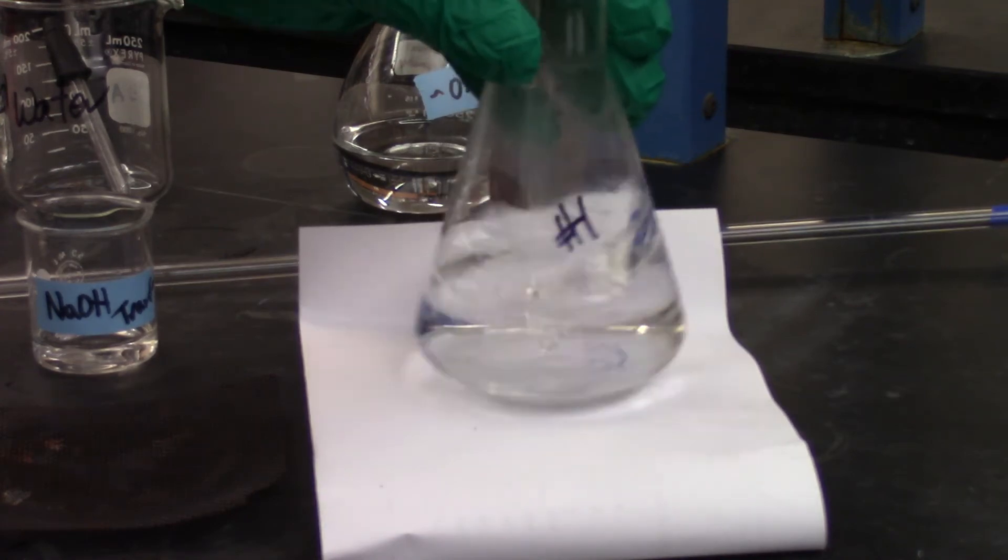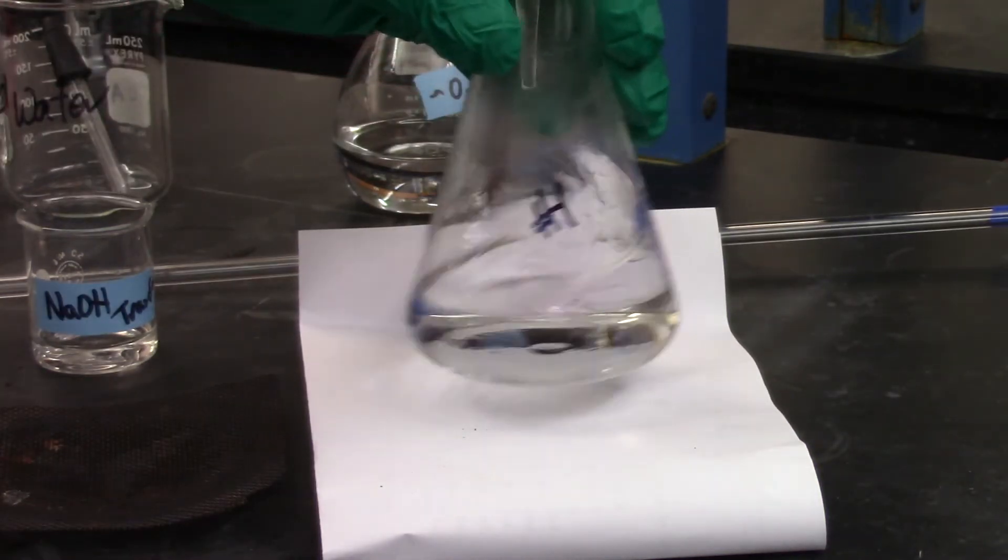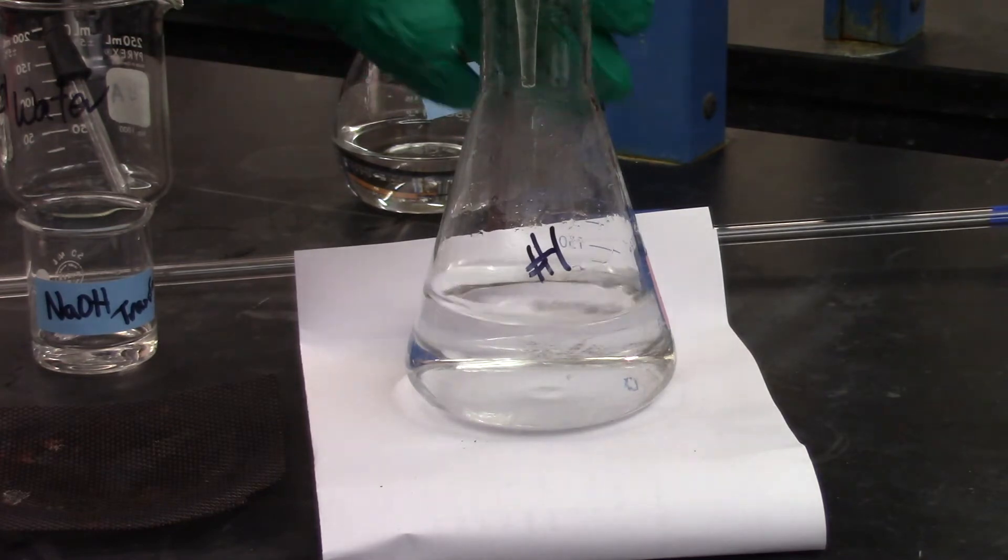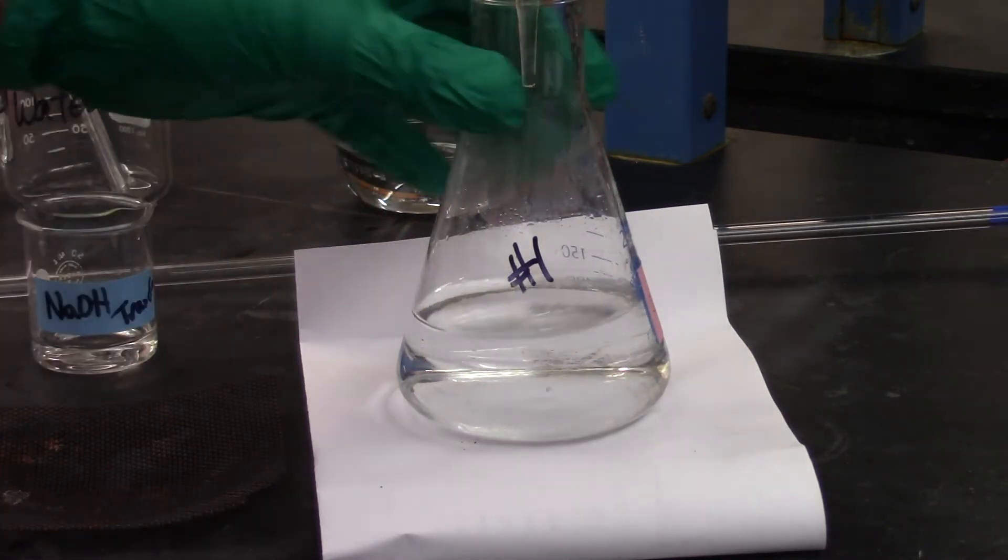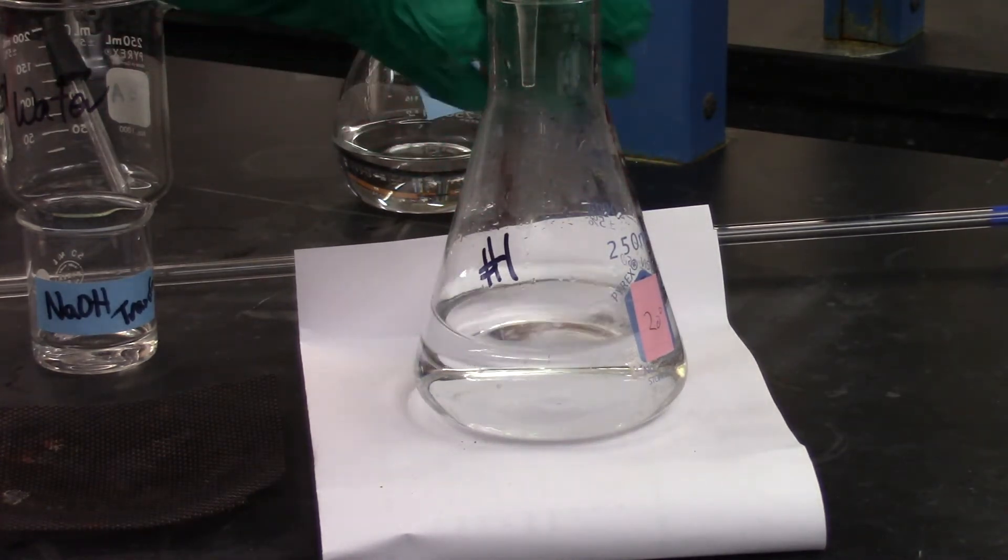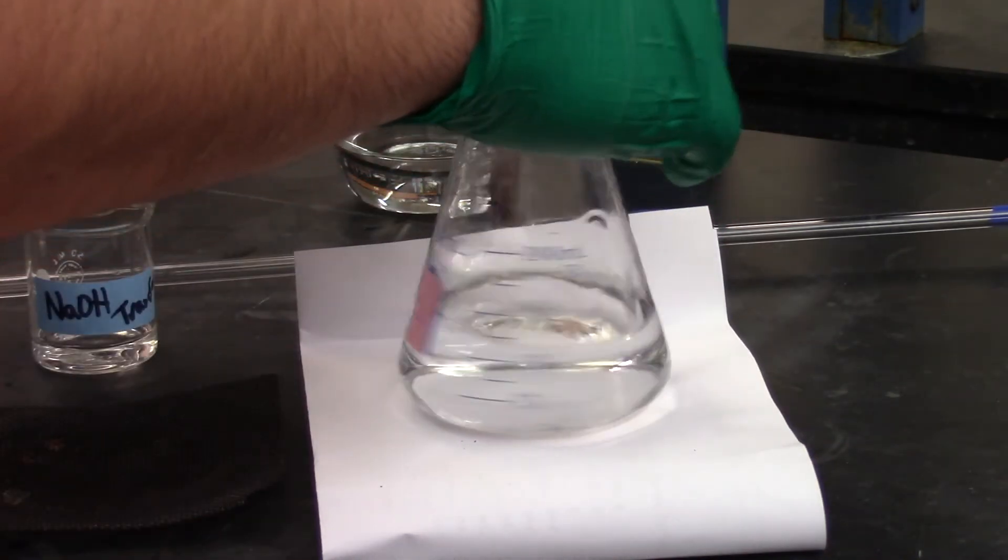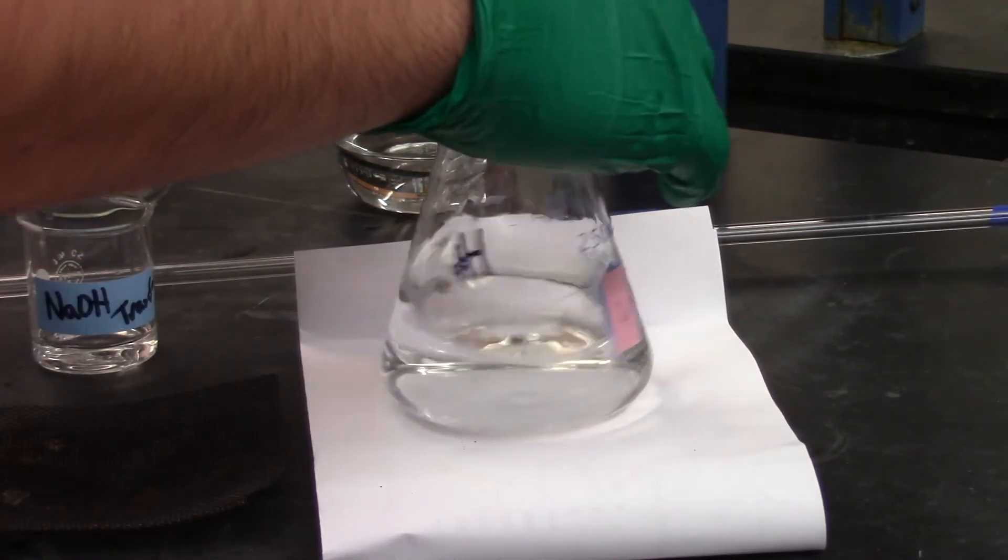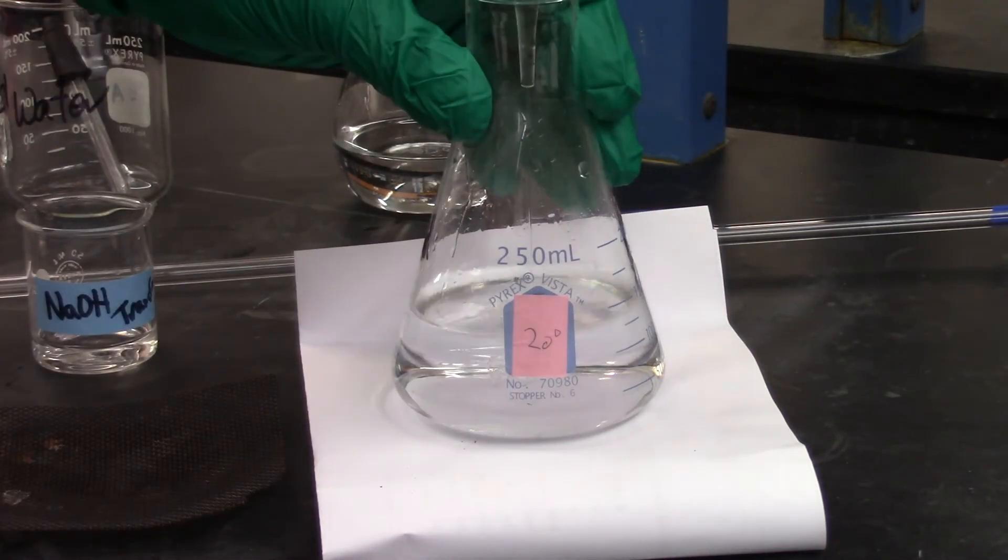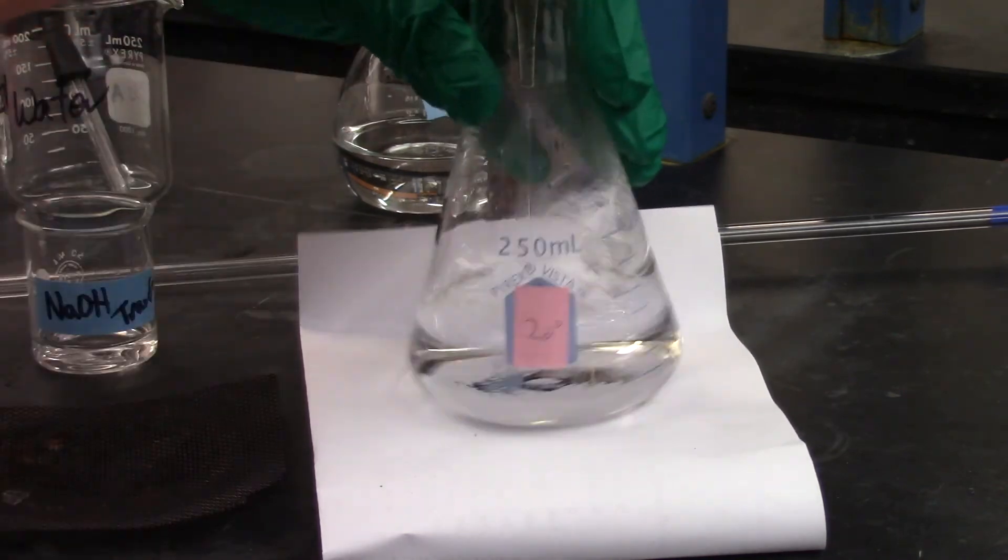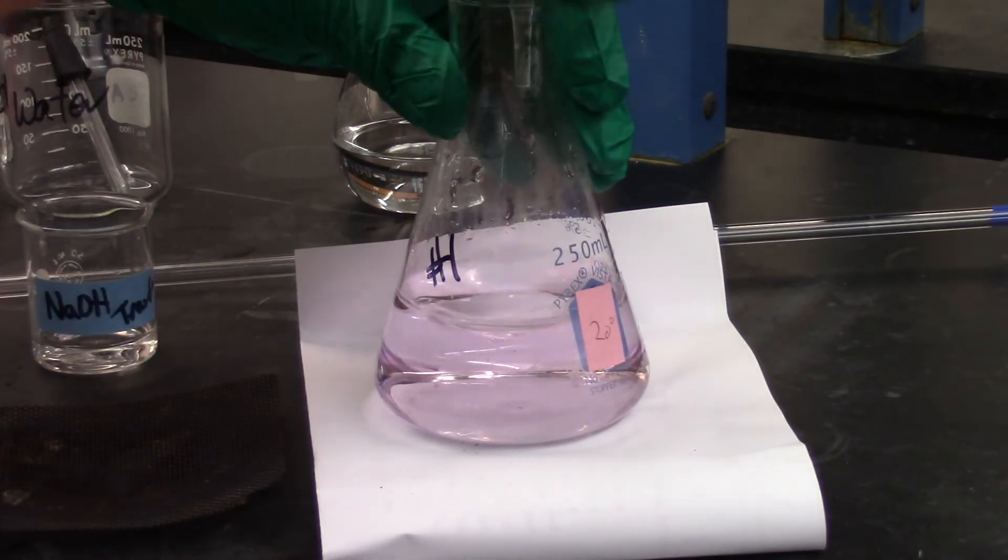So the end of the reaction is going to be once I have that full pink color throughout the solution. And we want it to be a very light pink because if we get it right at that titration volume, that's the exact amount of NaOH we needed to react with the KHP in here. So this is flask number one. Let's actually rinse this down so you can see. You can see as you get closer to the, oh, and there we go.